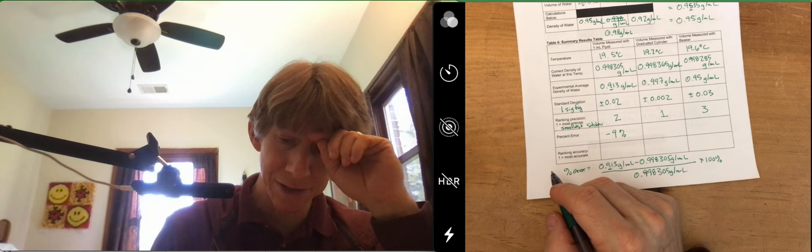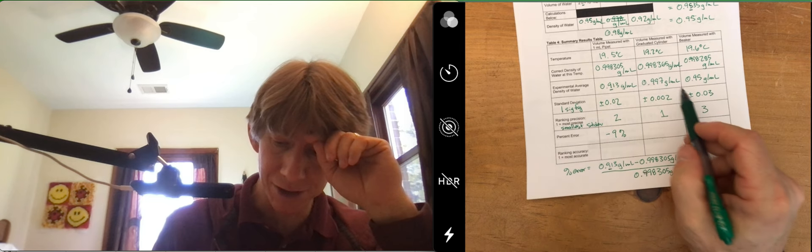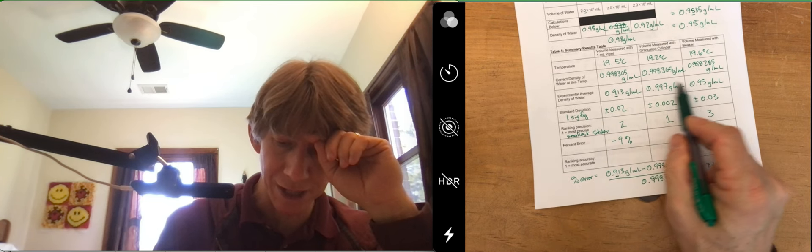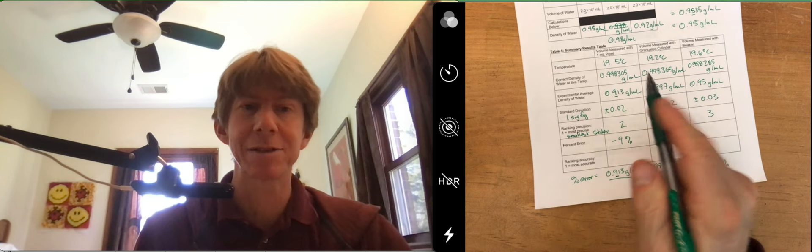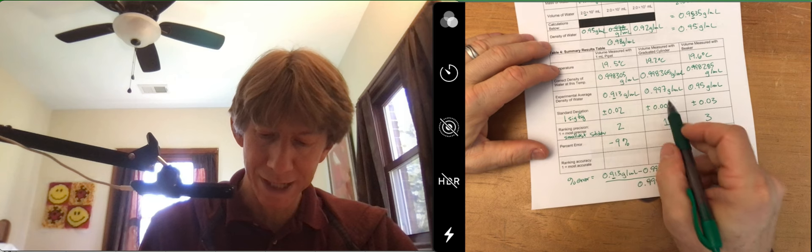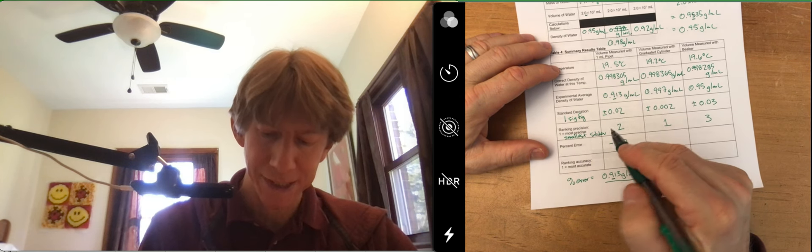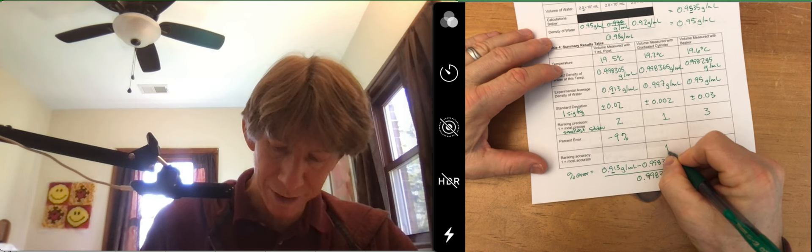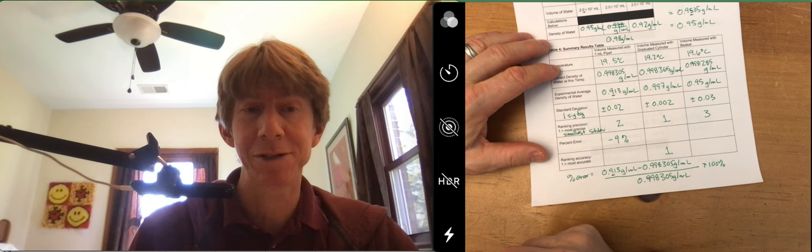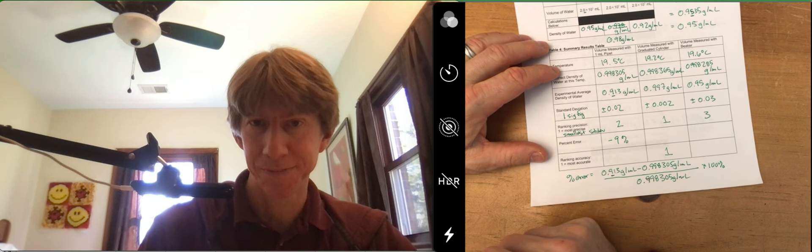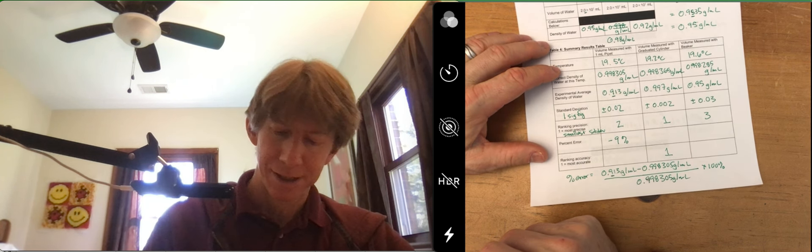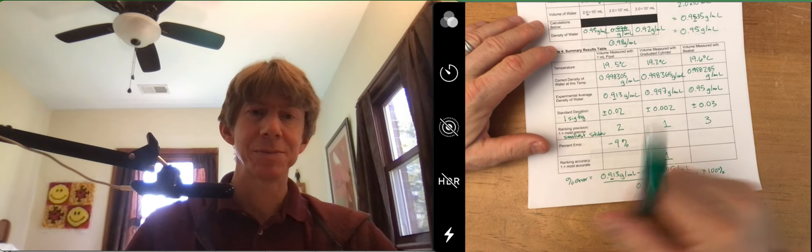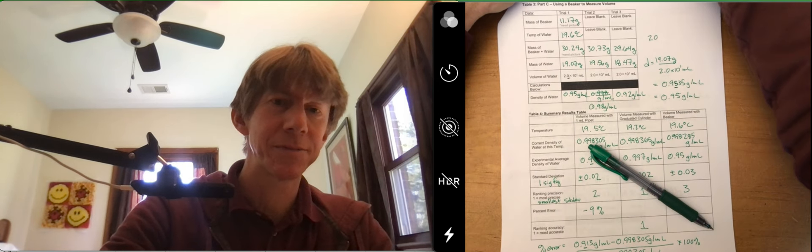And all of these are negative because all of these average values are less than the correct value. Although 0.997 and 0.998, I have to say, without even doing it, I know that my graduated cylinder is going to be the most accurate as well. And I will let the rest for you to do. Please ask any questions you have.